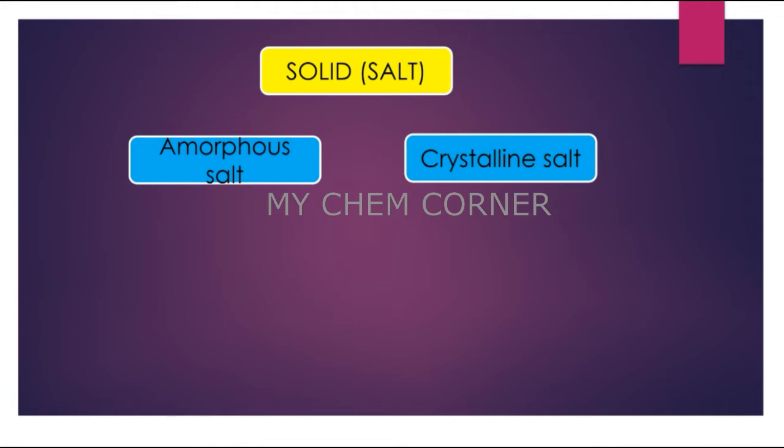It's quite moist also. Whereas crystalline salts are more crystal in nature. When you touch them, you would feel like it's table salt. You can feel the crystals whenever we take the salt. So that is your amorphous and crystalline salt.